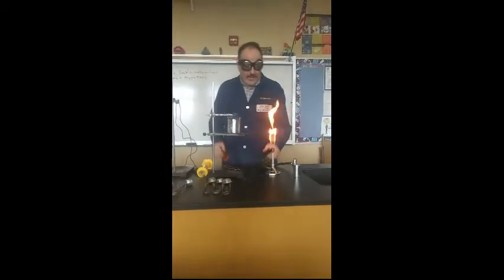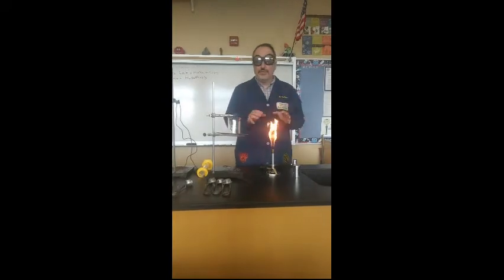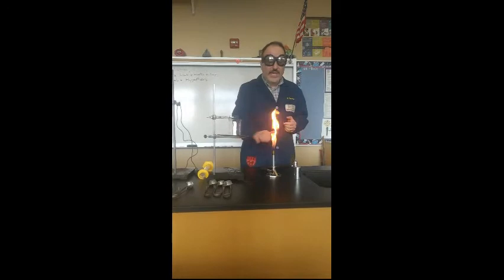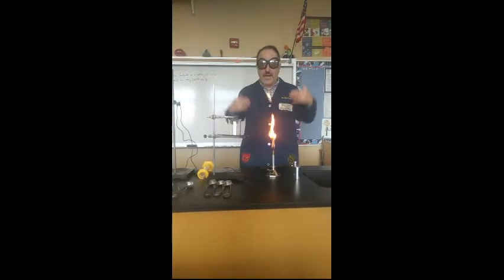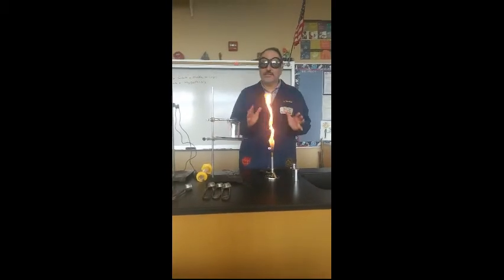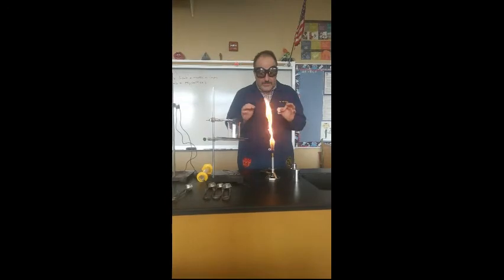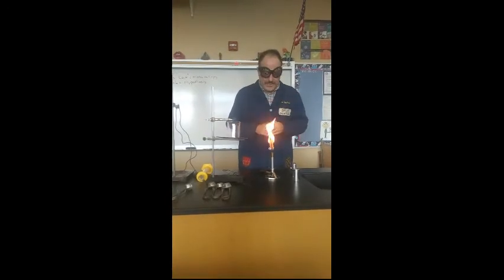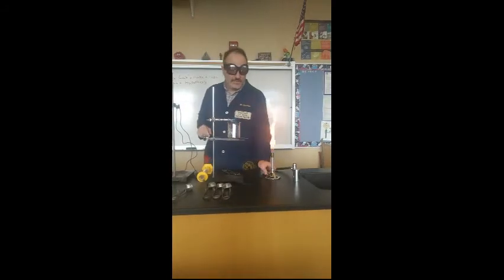All right? Now, this right here is the coolest flame that this thing produces. It really cannot hurt you, okay? As long as it's just a brief thing, and you've got your hair tied back and so forth. So don't be afraid of it. But because it's such a cool flame, it'll take forever to heat up a beaker of water, for example. So we want to increase the temperature.